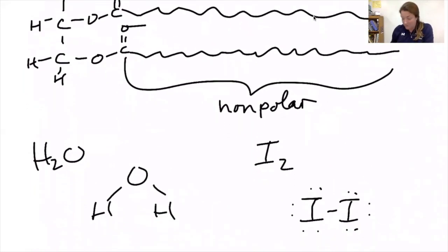Water, as you know, is polar and it has hydrogen bonds, and iodine is nonpolar. Take a look and see whether the iodine dissolves in the water or it dissolves in the vegetable oil.